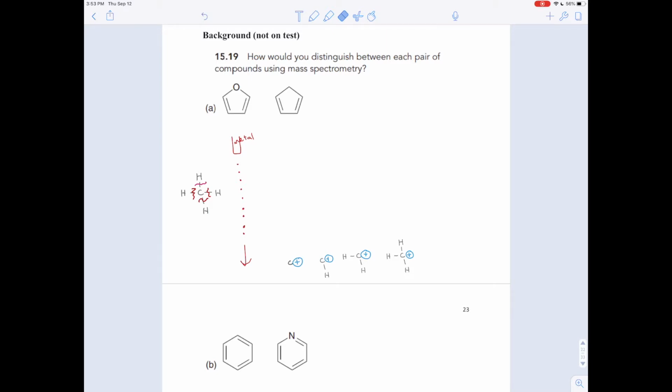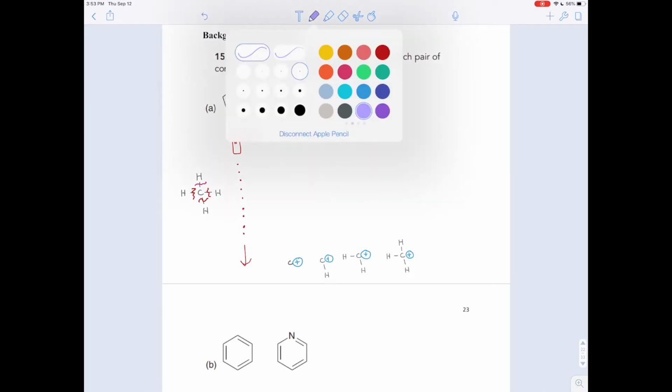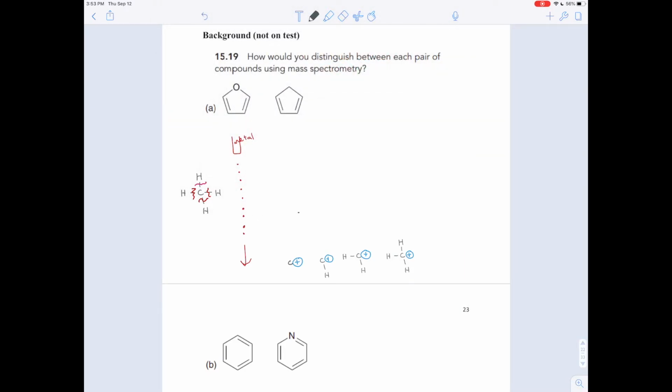Okay, so we were just saying, the heavier molecules won't turn as much, and lighter molecules will turn a lot. And so based on where a fragment hits the detector, you can tell how massive the fragment was, because it'll either have to turn more or less to hit a detector in a certain place. And so you'll get a spectrum. On the x-axis of the spectrum, it's basically going to be the mass. Now, technically, it's not the mass. You won't see the word mass there, but you'll see what's called the m/z ratio, the mass to charge ratio. That's the mass divided by the charge.